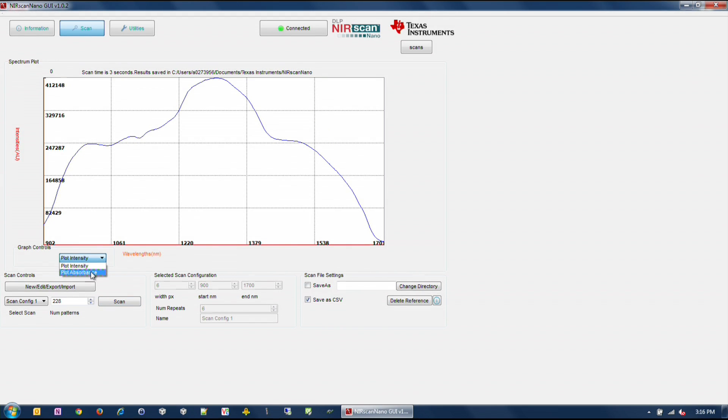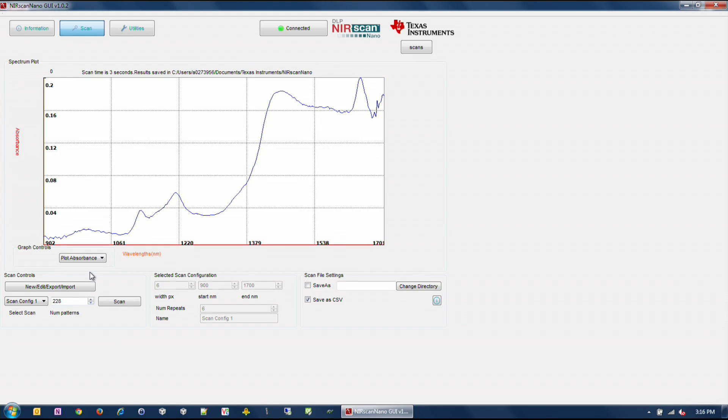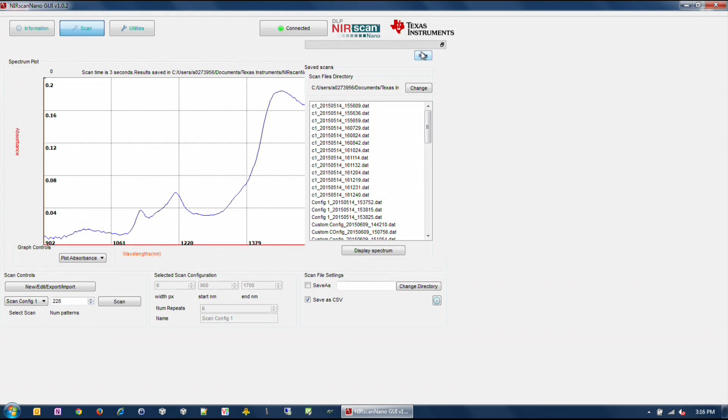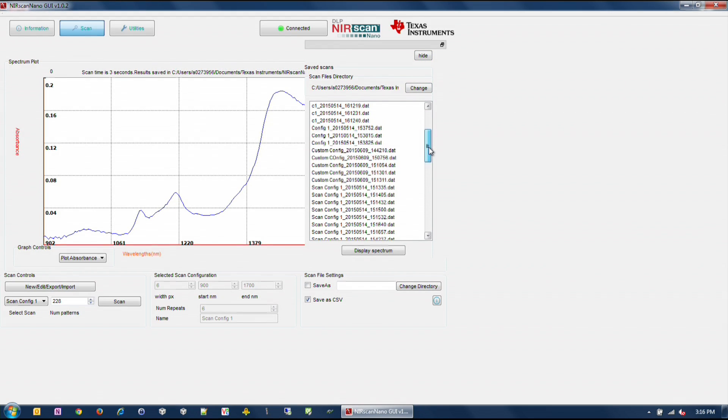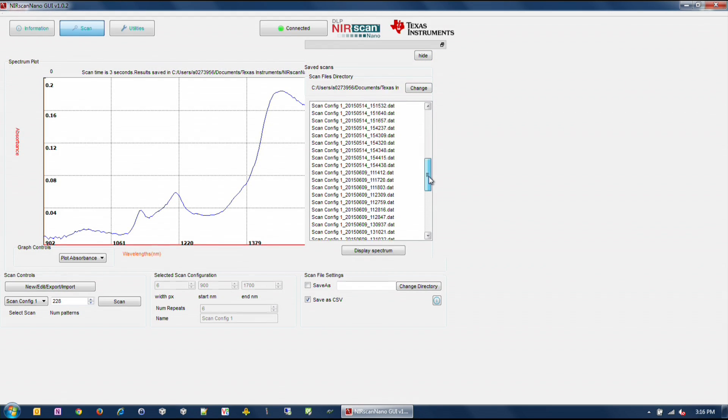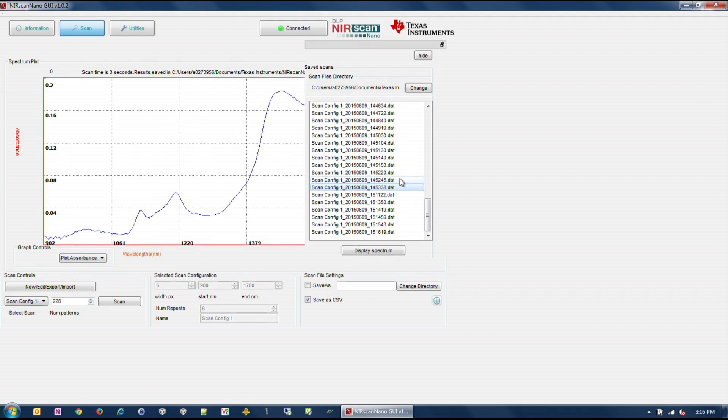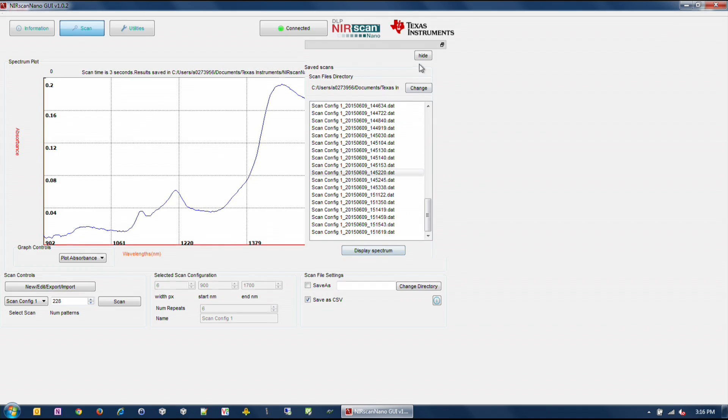To display previous scans, click on the Scans button under the Texas Instruments logo. A sub-window will pop up displaying the previous scans stored in the PC. The files are stored with the name of the scan configuration appended with the date and time of the scan. Selecting one of the files and clicking on the Display Spectrum plots that file. Click on the Hide button to hide this sub-window.